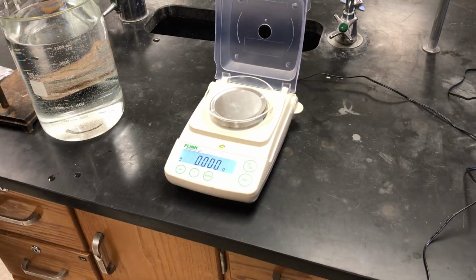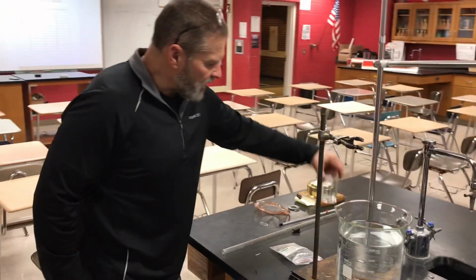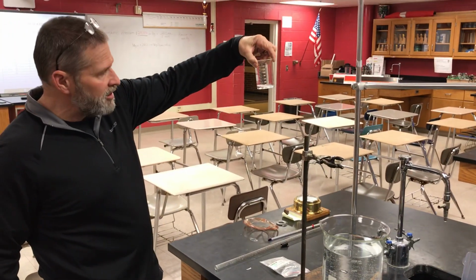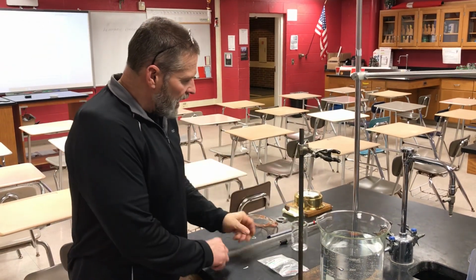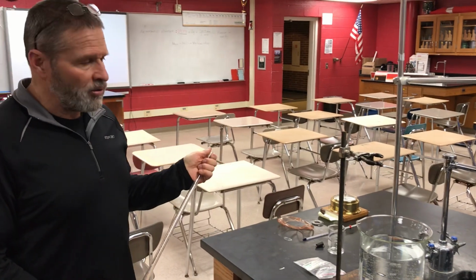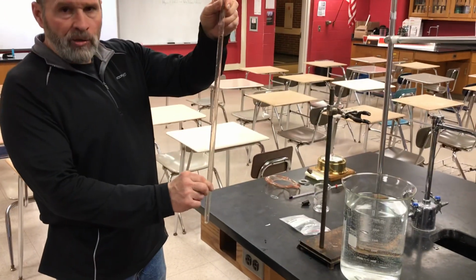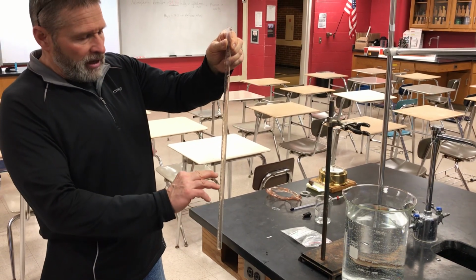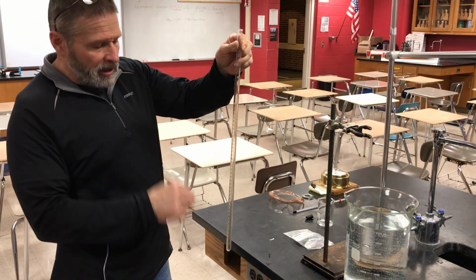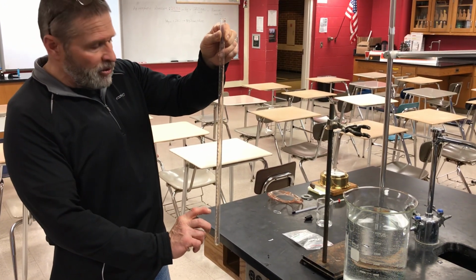Now there is a little bit of trick to running this. What we're going to do is use concentrated hydrochloric acid, which we've poured some into this beaker. And concentrated HCl is more dense than water. So we're going to pour that first into the eudiometer, and then carefully add water on top of that HCl. Because it's more dense, it will just sit down here at the bottom of the eudiometer.